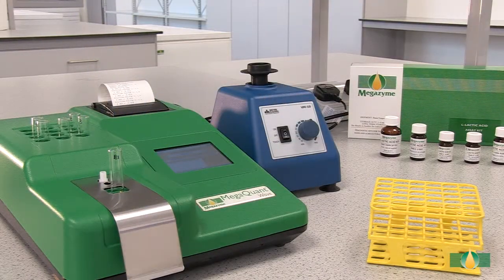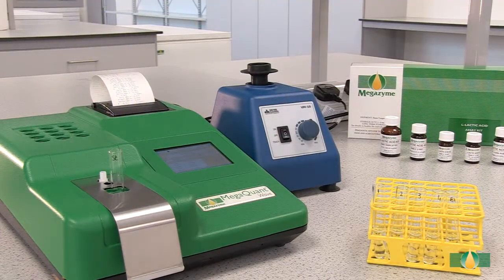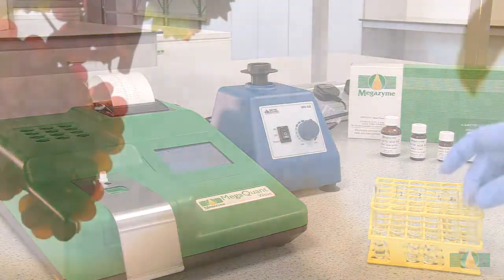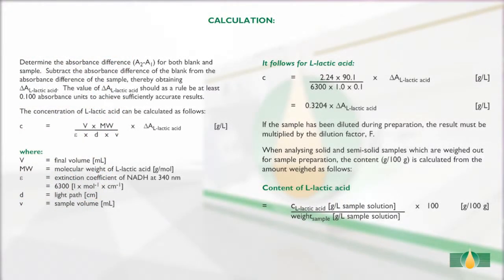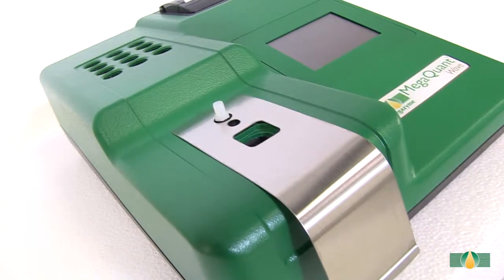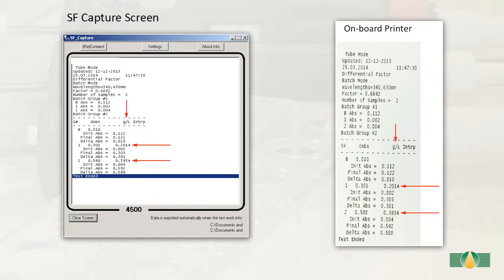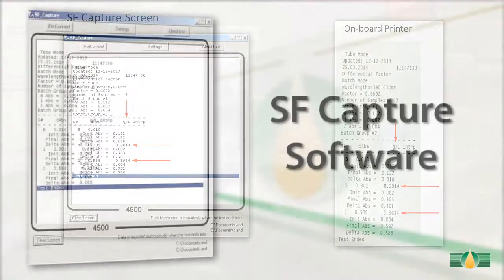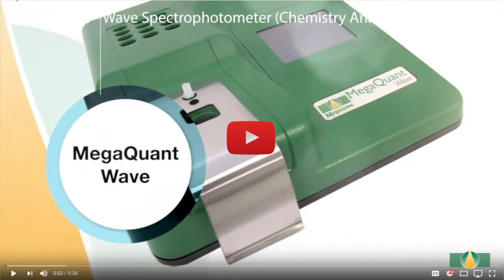Record the absorbance reading, A2, for all of the assay tubes. This absorbance reading completes the measurement of L-lactic acid. The absorbance readings A1 and A2 of the sample and the blank reactions are used to calculate the L-lactic acid concentrations in the original samples. When performing this test using the pre-installed protocol on the MegaQuantWave spectrophotometer, the results will be automatically calculated and printed via the onboard printer, or the data can be exported to a computer using the SFCapture software.